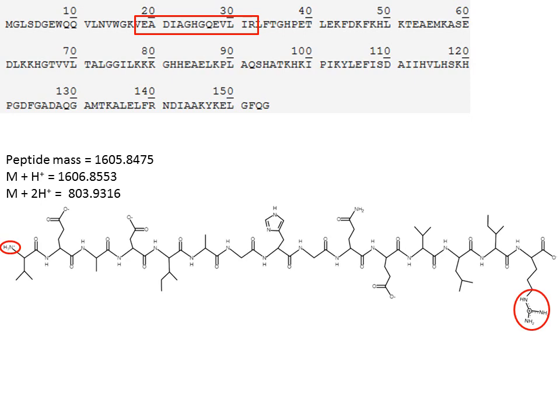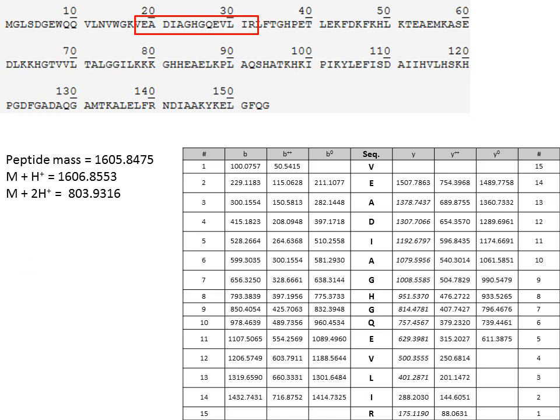From the amino acid sequence, we can tabulate the theoretical mass of fragments that would be produced from the intact peptide. For example, if one molecule was fragmented and broke through the most C-terminal peptide bond, the arginine would be released. In the MSMS spectra, we would observe an ion of 175.1.